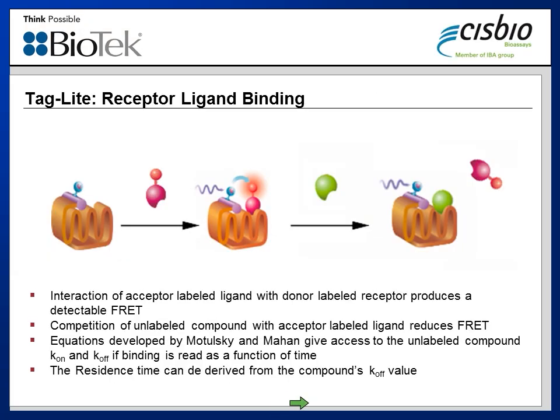The second mechanism of action project was performed to study the correlation of ligand binding to the CXCR4 chemokine receptor, as well as interruption of that binding, and then how it relates to the final invasive phenotypic effect. The expression of CXCR4 is tightly correlated with the metastatic properties of breast cancer cells, and in vivo, neutralizing the interaction of CXCR4 with its known ligand SDF1 alpha, also known as CXCL12, significantly impaired the metastasis of breast cancer cells and cell migration.